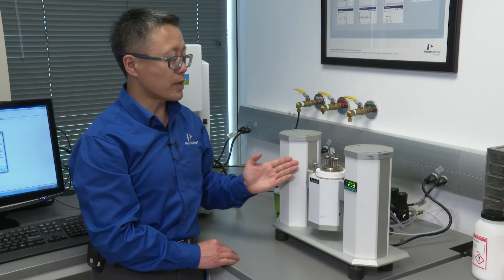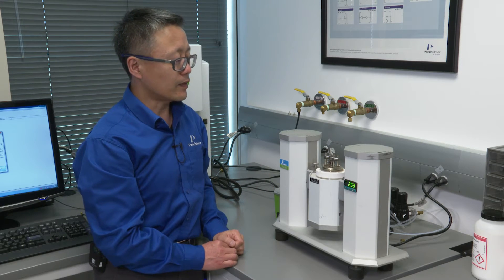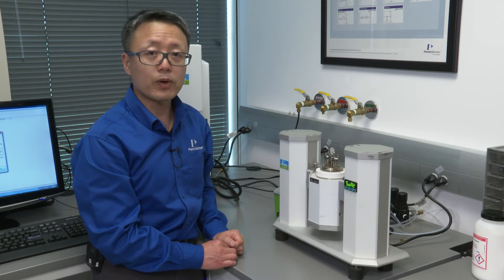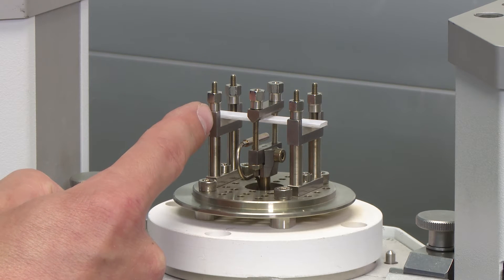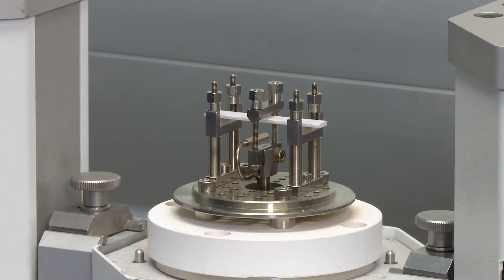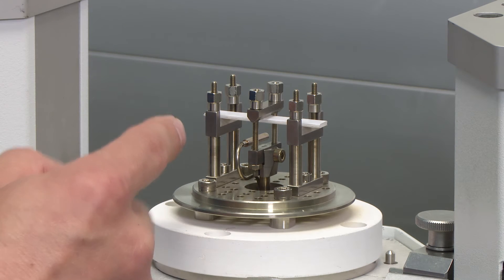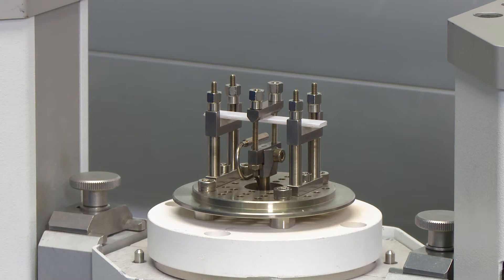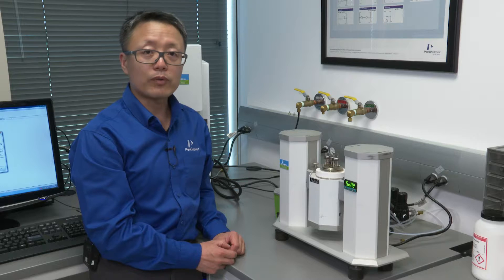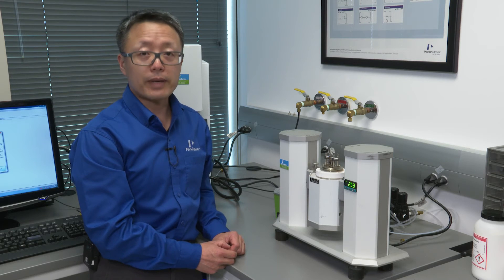Then you want to measure the sample length. The sample length for three-point bending is between one of the outer knives and the center knife. Or you can measure the distance between the two outer knives and divide that length by two. That will be the sample length for three-point bending.